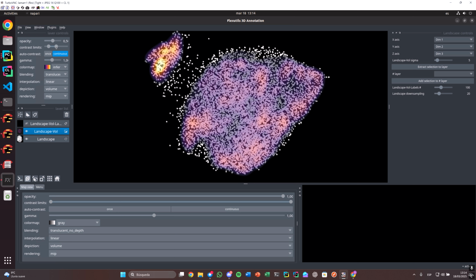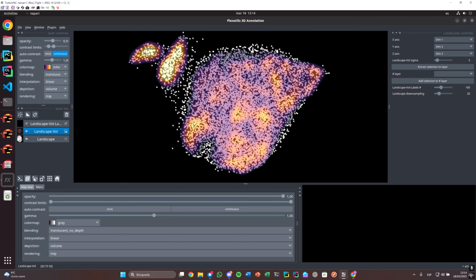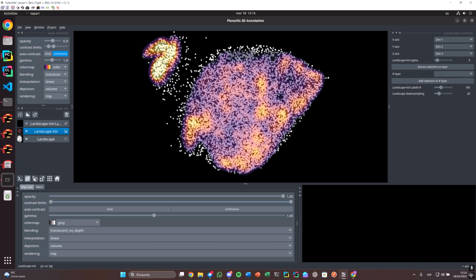And we can also decrease a little bit the upper contrast to make the other densities looking more bright. And now we are seeing much better what are all the finer densities computed by this program. This could be useful to identify, for example, how these different regions are connected, which regions are more populated than others, and probably identifying interesting conformations in our conformational landscape.